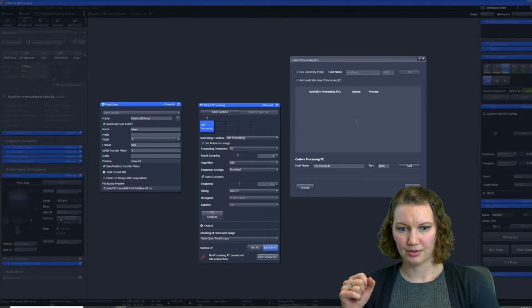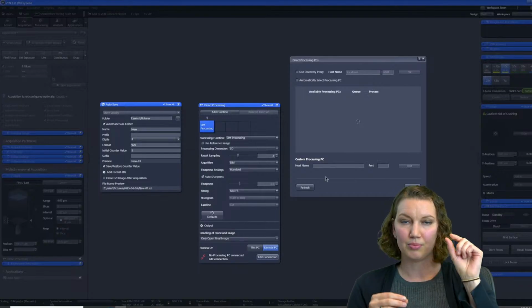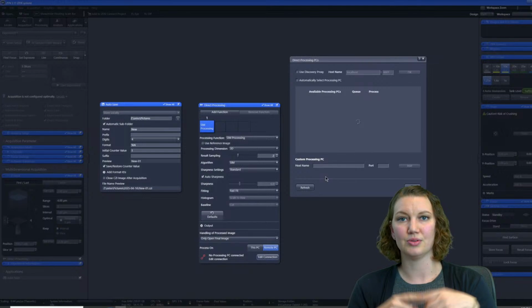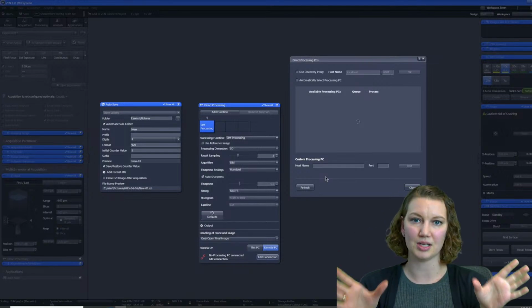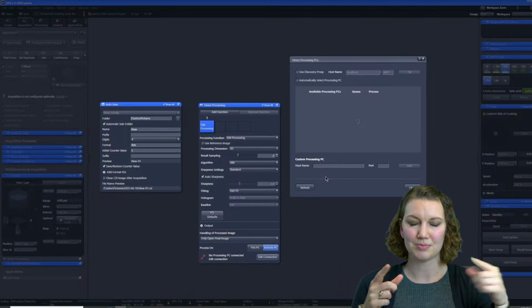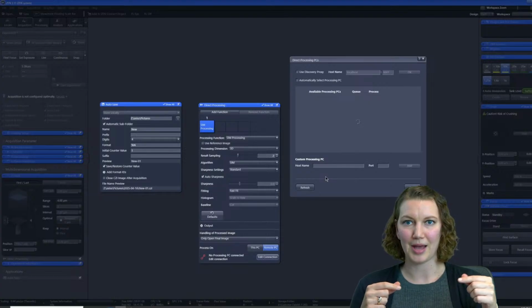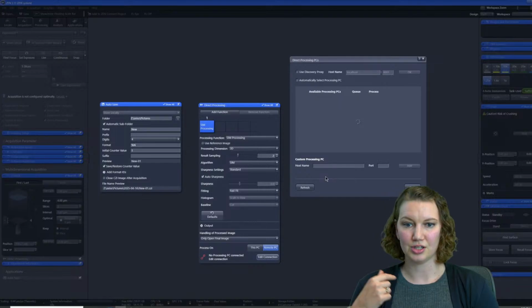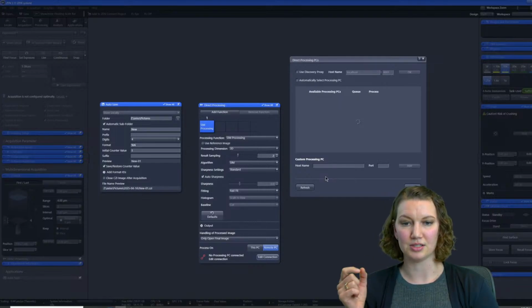And so, let me back up. So if you notice in the beginning, it said process on other PC, but nothing had been added yet. It can't see that connection. So this is where, again, I like to highlight this just because occasionally Windows updates messes up some of the backend stuff we initially set up. So if you do ever have to troubleshoot, you just go and edit that connection and type in those IP addresses that are always our default addresses.